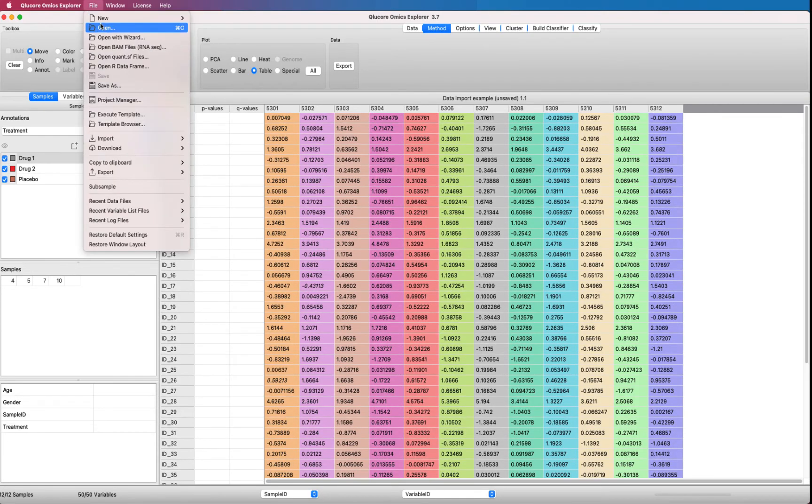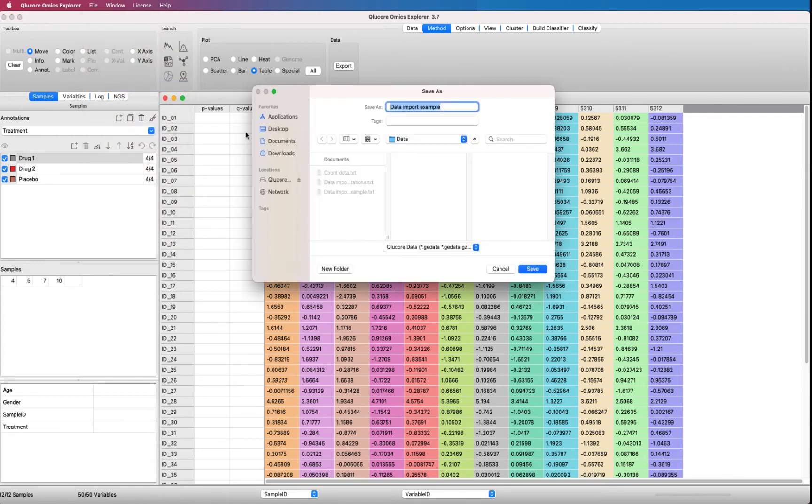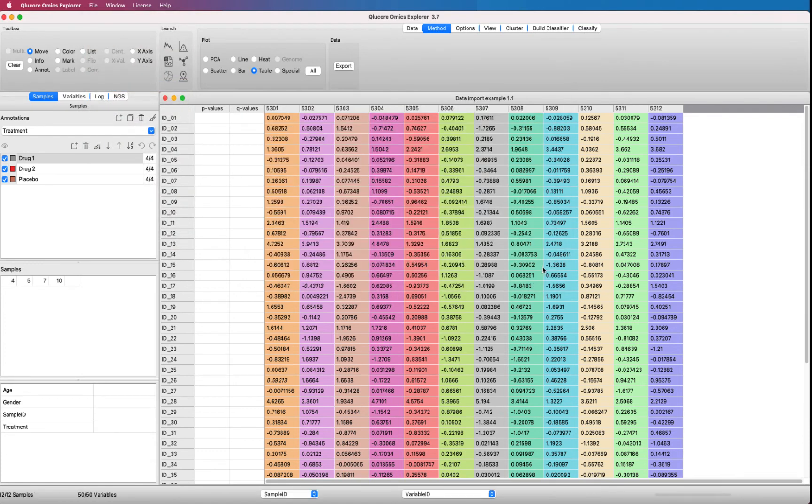Remember to save the data. A good choice is to use the GE data format. This will make it faster to open the data set next time.